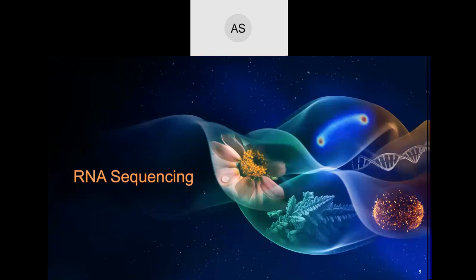moving on to RNA sequencing and why we are all here. And you guys will notice that RNA sequencing that Illumina does, and that we're going to be talking about primarily, is just a remarkably elegant use of kind of all the technologies that have come before it.